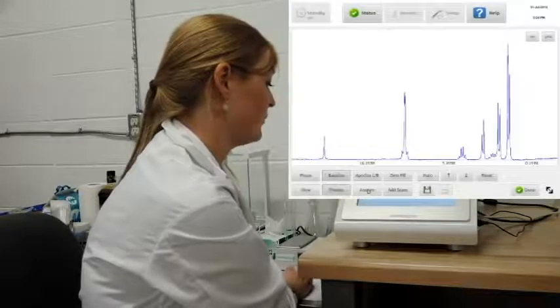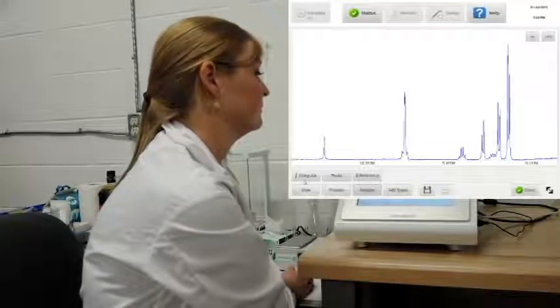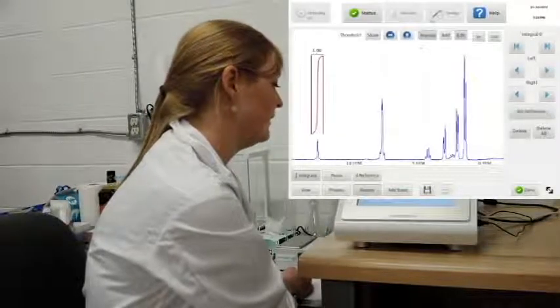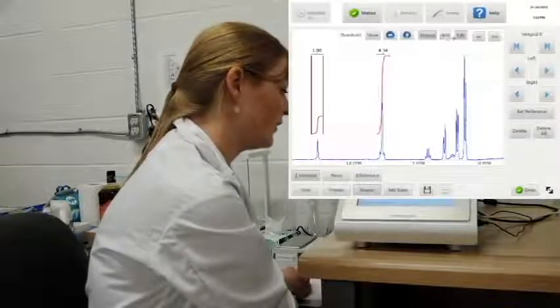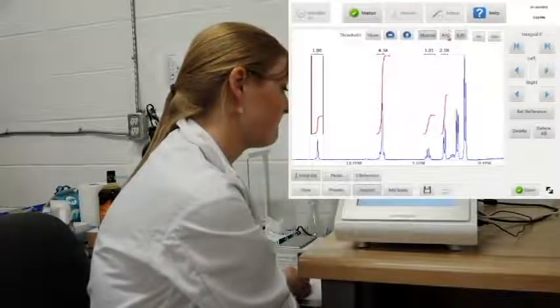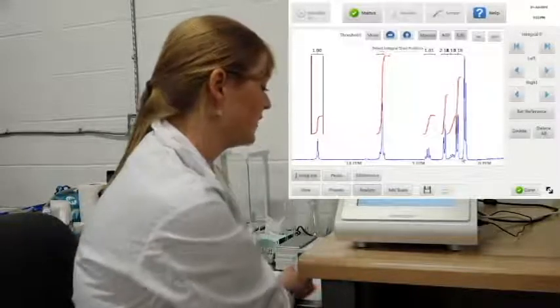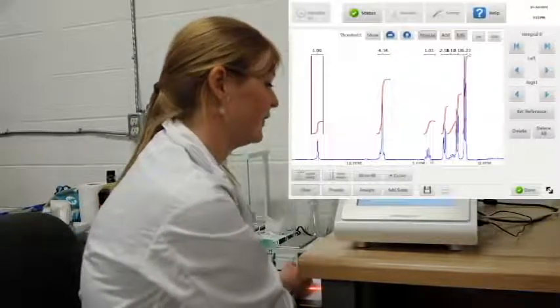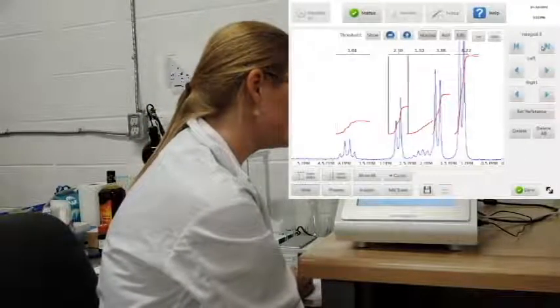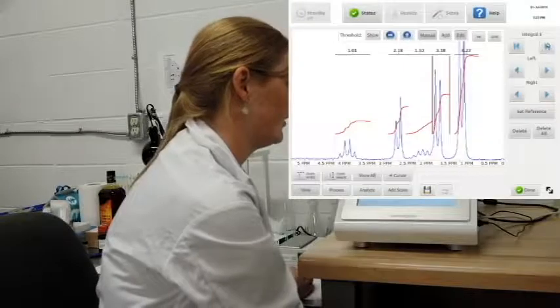Okay, so now I'm just, like I've done before, I'm going to baseline correct and go in and integrate my peaks. Okay, so I'm going to use again my mouse just to give me the rough integration here that I can then tidy up using a little bit more fine control with the buttons. Okay, so it's a little bit hard to see in here, so I'm going to use my view. I'm going to zoom in on the alkyl region so they space out a little bit, maybe give them a little bit more height. And I'm going to go over and just make sure I'm happy with what my integrals look like. There, of course, is a little bit of overlap here, so the integrals don't look the best. But I can still get pretty accurate integrations from them anyway.